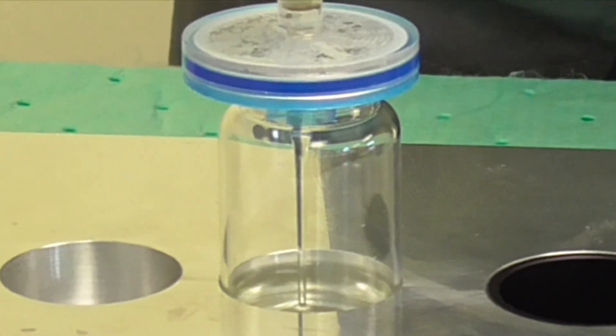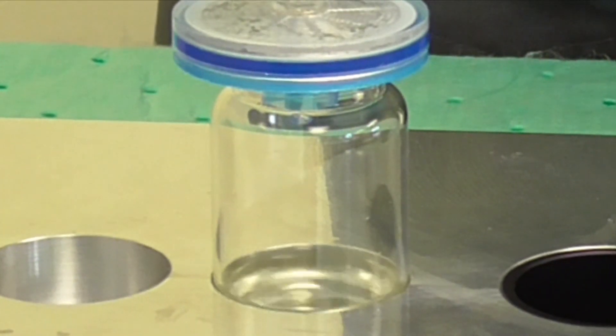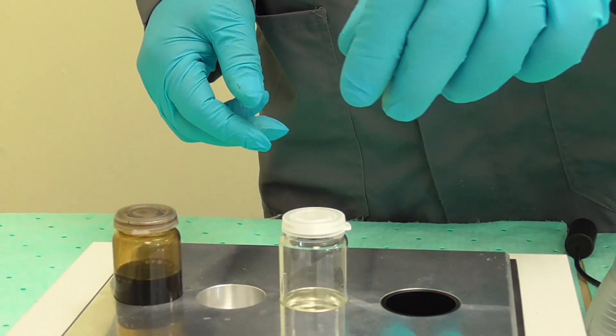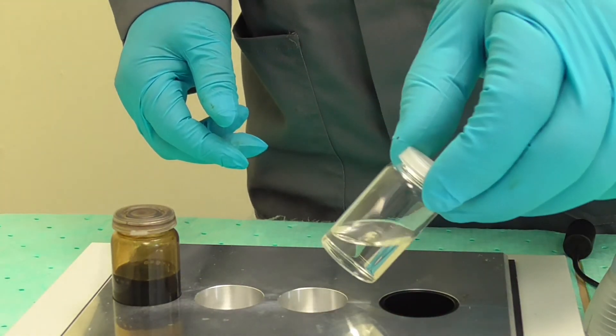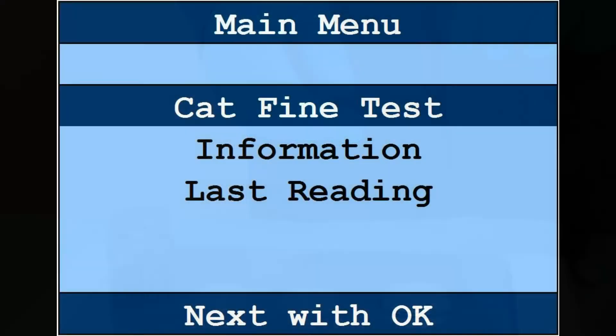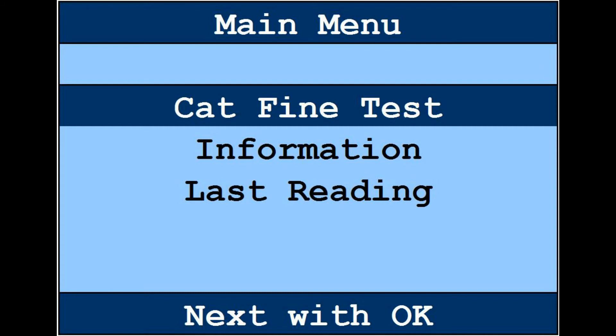Cap the vial and clean the outside with vial cleaner and a clean tissue. Place it into the measuring chamber of the device.